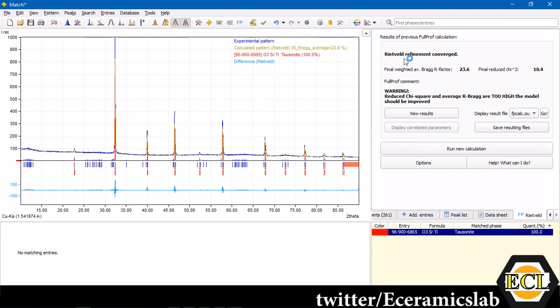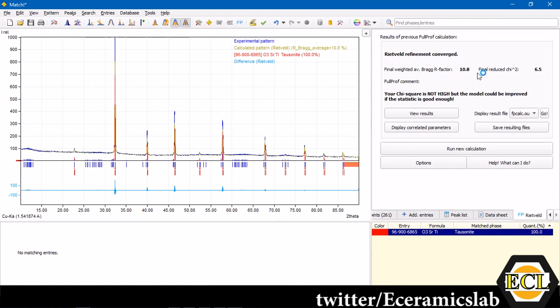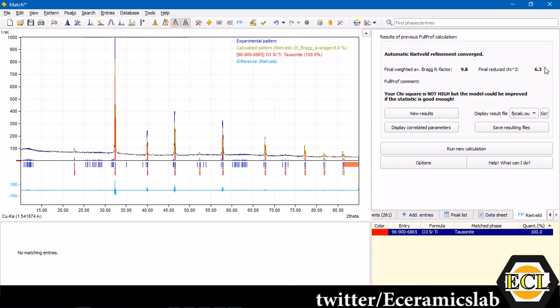Here you can see on the right-hand side, it shows Rietveld refinement FullProf calculation going on. Here there are two parameters given, final reduced chi-square and final weighted average Bragg R factor. Final reduced chi-square is actually a goodness of fit. That means, how close is the fitting data. In Rietveld refinement, what happens is, your diffraction data is matched with the simulated data. And the matching is done using least square fit. The error between the two has to be decreased using least square fit. The lower the value of chi-square, it means the better fitting. It is much more matching with your experimental data.